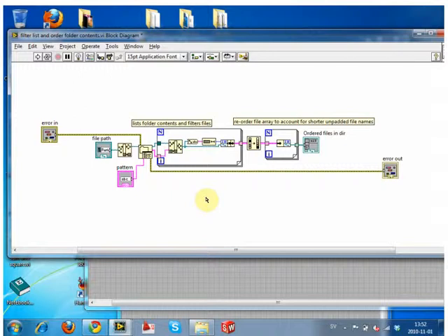Windows will order them the way that I showed you. Unless Windows 7 and Vista exhibit differences, they're taught how to deal with it. But lower level languages like programming code aren't taught how to deal with it. So you have to think, I have this list of files and I don't know how to order them. I have to give each of the files some kind of identity so that I can order them on something other than their number, because I'm already being told that it can't list them in the right order.